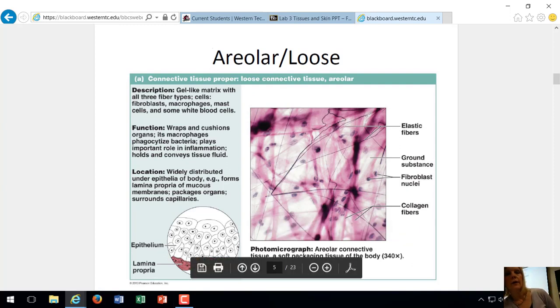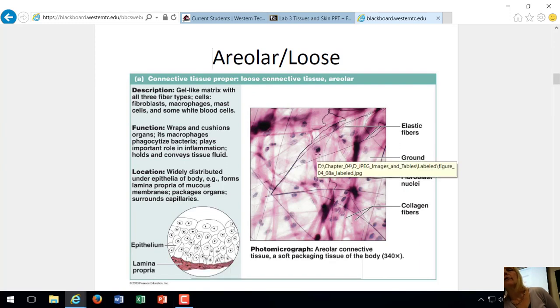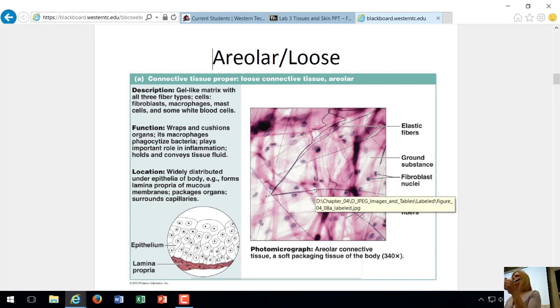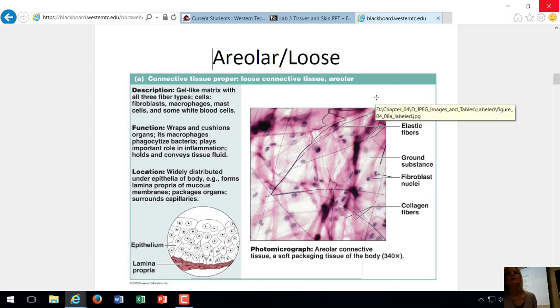And these little black cells, those are the nuclei of the fibroblasts that make the collagen. And then we see these elastic fibers too, which give it some stretchiness. So when you sit down or wiggle around in your chair, your skin doesn't tear underneath because this areolar tissue has some movement to it, has some stretch. The way to identify it, it almost looked like someone threw some hair on the microscope slide. You can see those dark elastic fibers. That's a good way to identify areolar tissue. It's the only tissue that has those dark kind of stranded fibers, elastic fibers. You can just say underneath the skin, packaged around organs. Either one of those is an acceptable location.